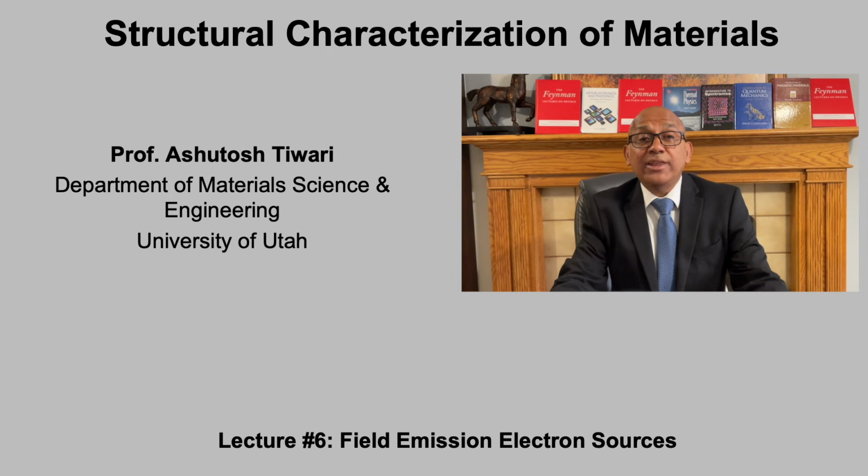Building directly on that foundation, this lecture focuses entirely on field emission electron guns. We will examine how electrons are extracted from an extremely sharp tip using strong electric fields and how quantum tunneling, rather than thermal excitation, governs the emission process.